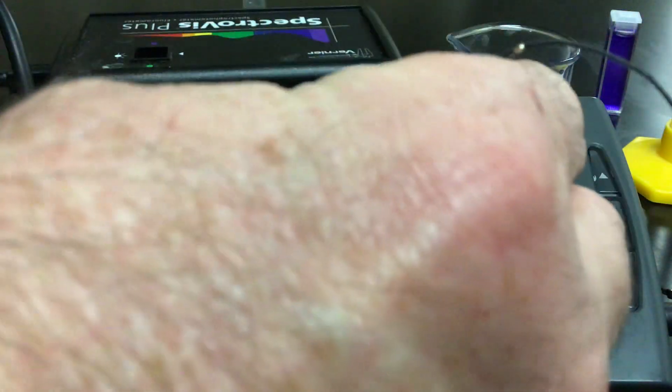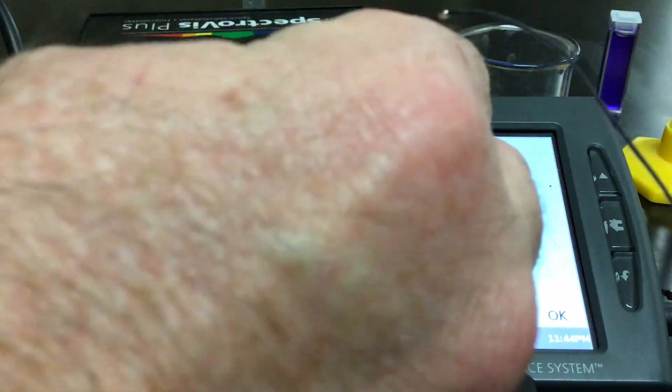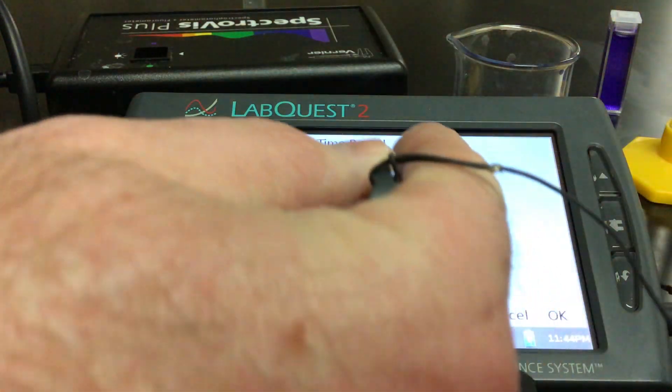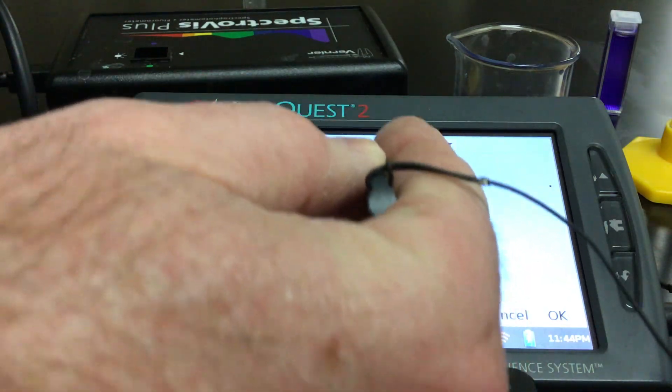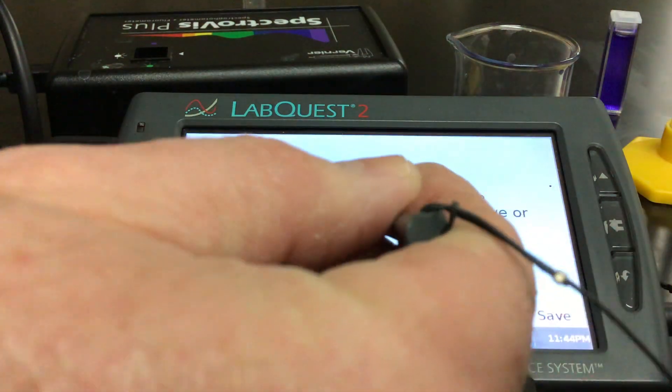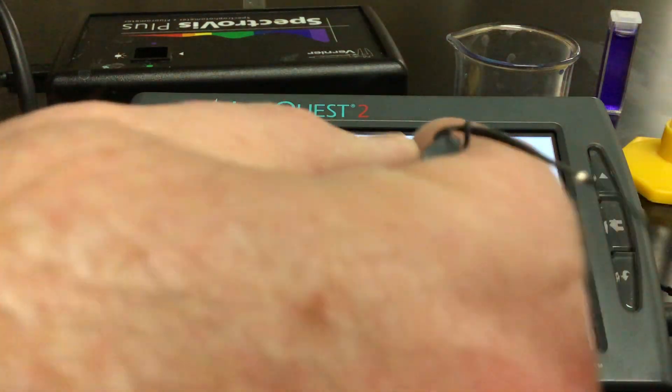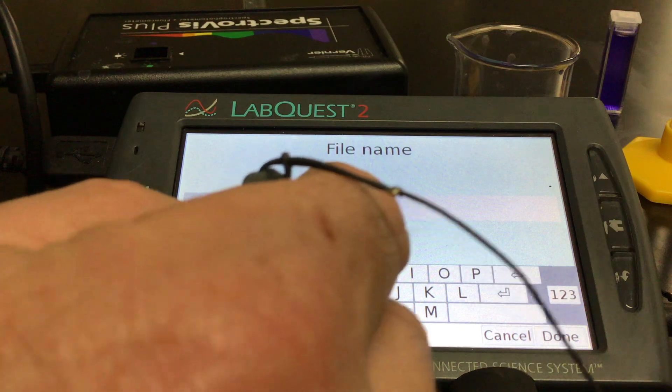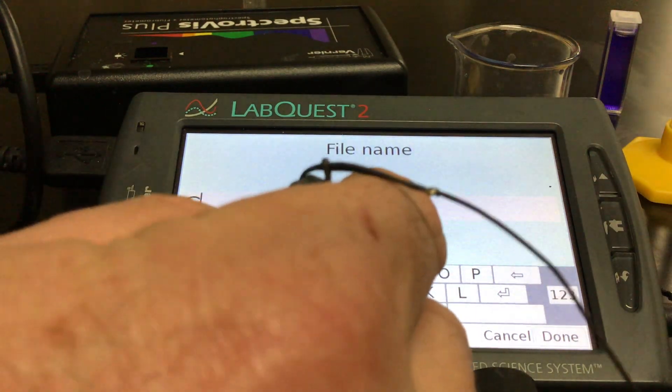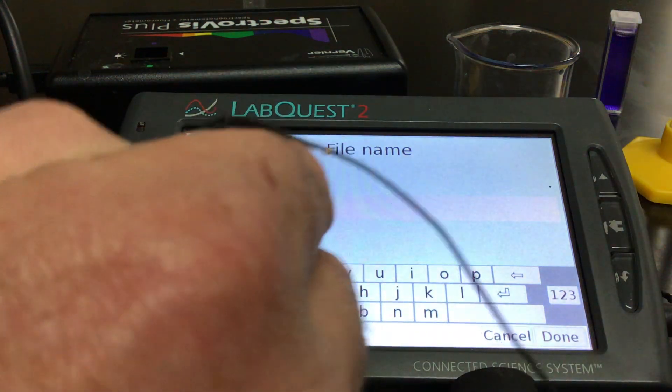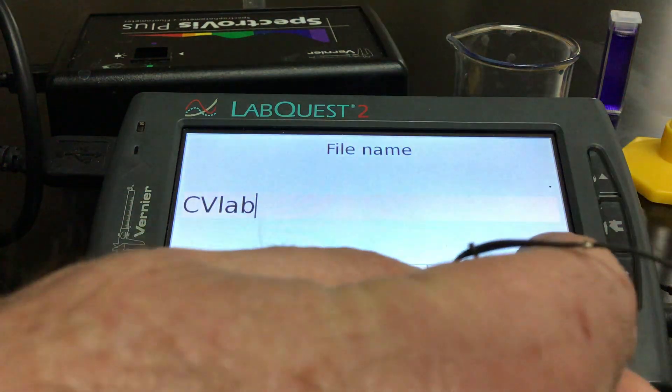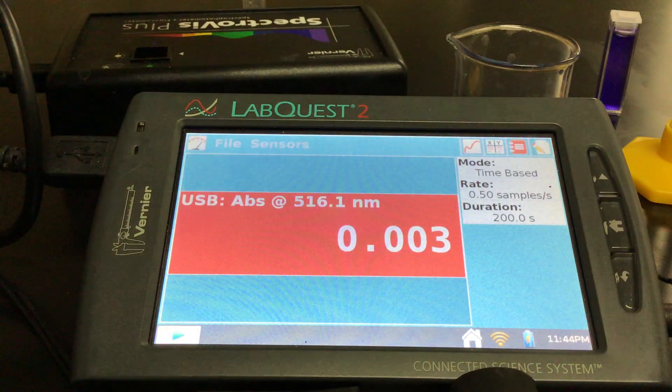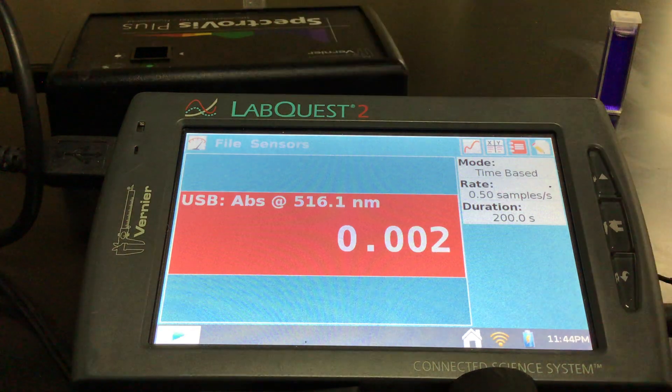I'm going to change the mode to time based and 200 seconds should probably do it. Just making sure it's taking samples pretty often here, which it is. We can save it and I'm just going to call it the lab. All right, save.